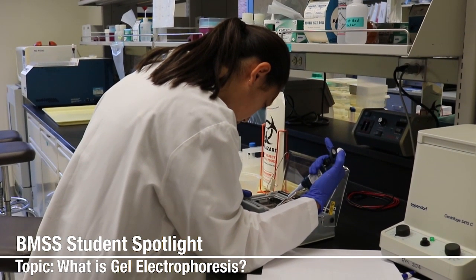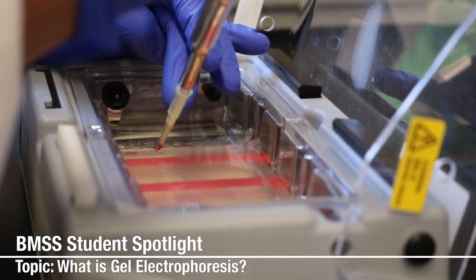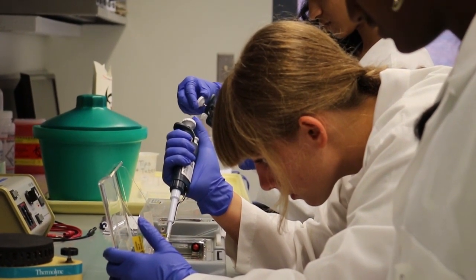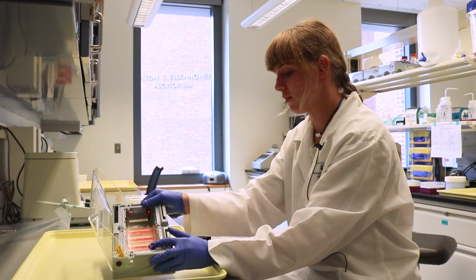This is how gel electrophoresis works. You would have a gel in here, and the gel would be molded with a comb so you'd have different wells to insert your sample into. You insert your sample into the agarose gel, and then an electrical current is applied. There's a liquid buffer over top, and an electrical current is applied. Because DNA is negatively charged, there's a positive end here and a negative end here.